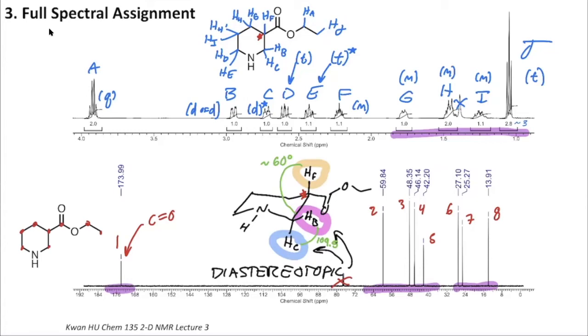So the splitting for this is somewhere on the order of 12 to 15 hertz. You may want to refresh yourself on these values on your common J coupling sheet. Regardless of what the actual numbers are, we can think about what that might look like on our structure. Looking at the signal for B, we know we have the larger doublet that's centered around here and here. That part is going to be split by our biggest J. In this case, I'm fairly certain that that's going to be the geminal splitting of B to C.